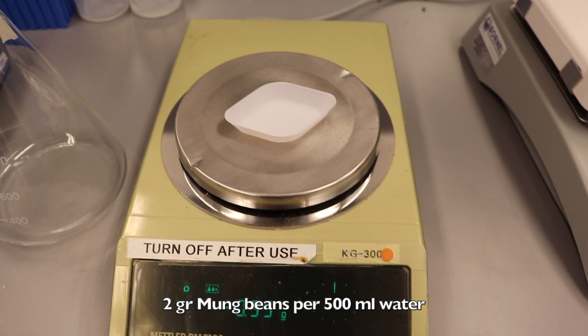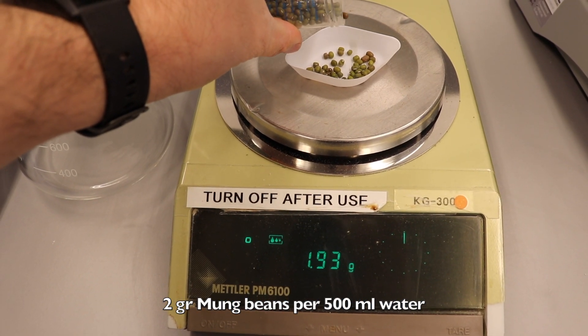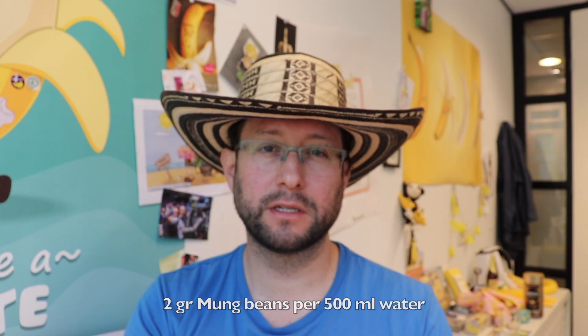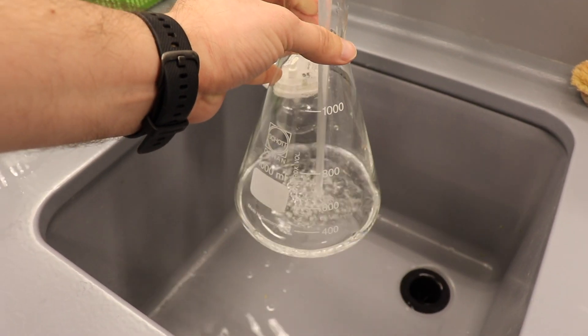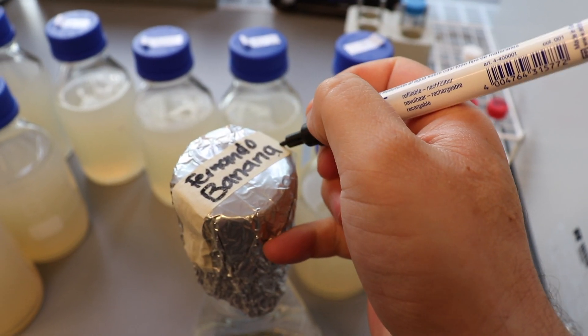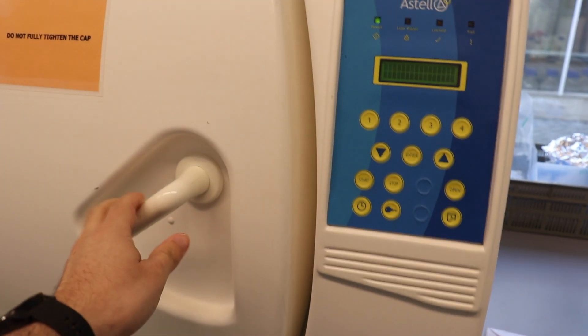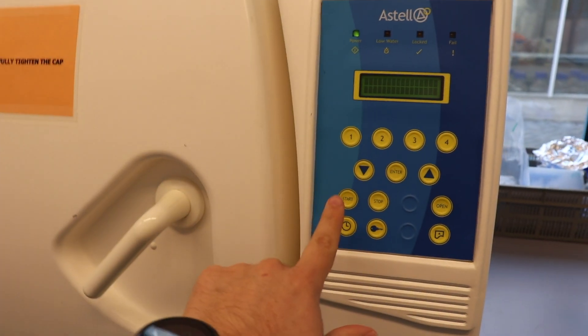We are going to weigh two grams of mung beans. The ratio is two grams of mung beans per half a liter of water. We put our water in, add the mung beans, cover with cotton plugs, and bring this to the autoclave. Here you can also use the time and space to autoclave materials you are going to use later, like cheese cloth that you can use to filter this material.